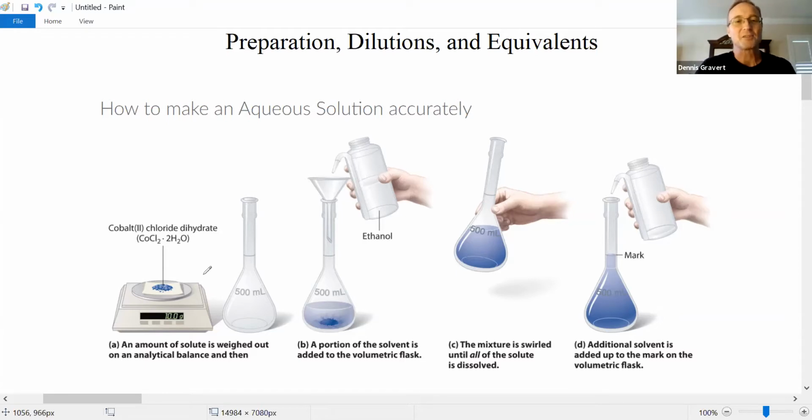Okay, and then you carefully put them into this container called a volumetric flask. Now we're going to use a volumetric flask anytime we need to have careful and precise measurements of concentration. Now sometimes in lab, it's like, okay, we just want to see if the experiment works, yes or no. So it'll be a little more sloppy and it'll be acceptable because we don't need really accurate data. We just want to get the main idea. So we might use a beaker or a graduated cylinder or Erlenmeyer flask, or test tubes, any number of glassware to prepare a solution.